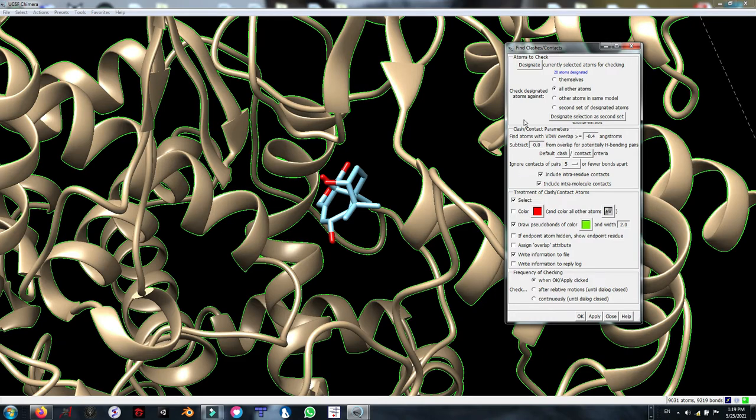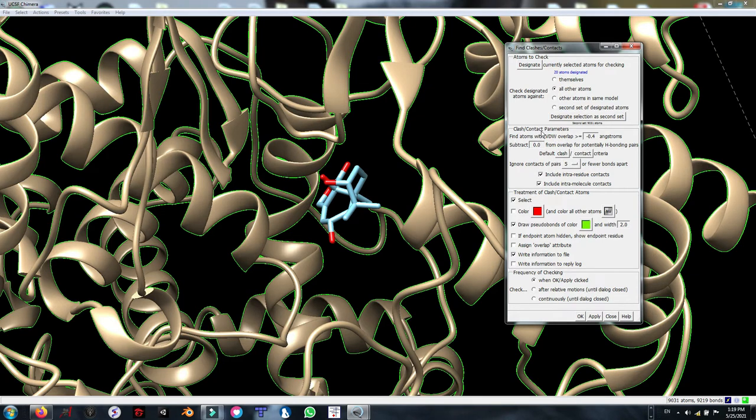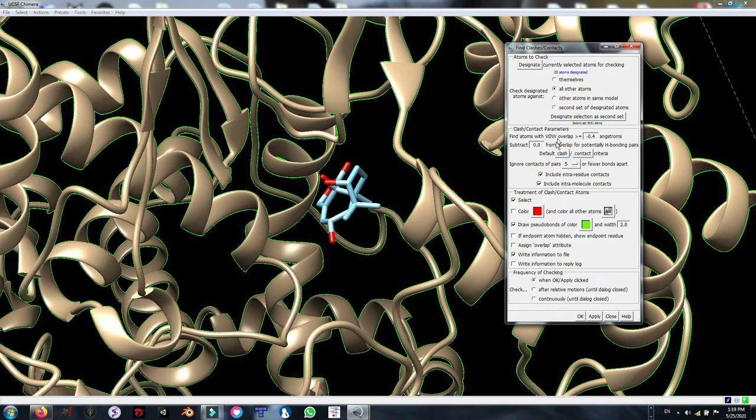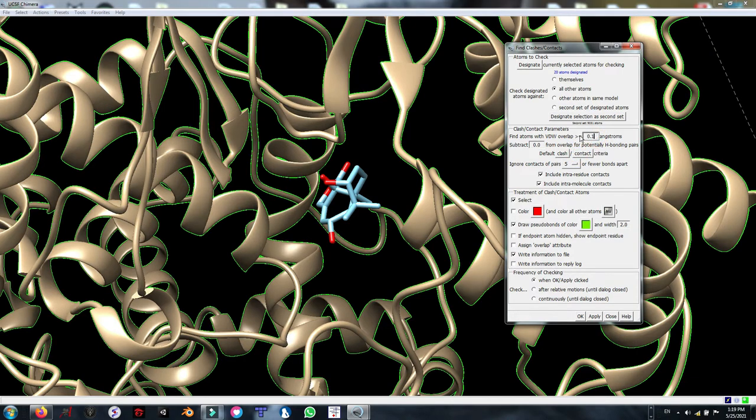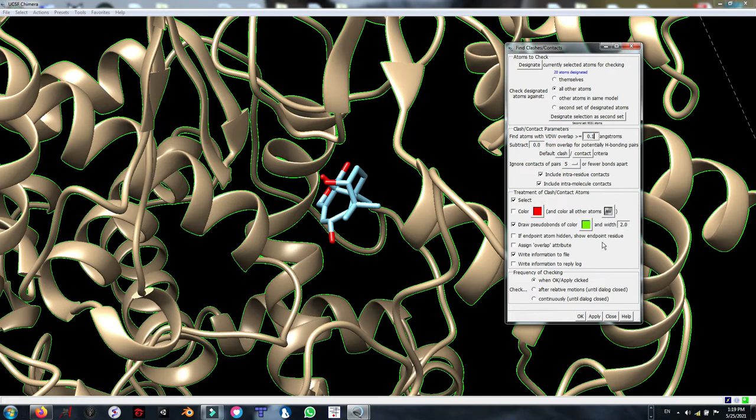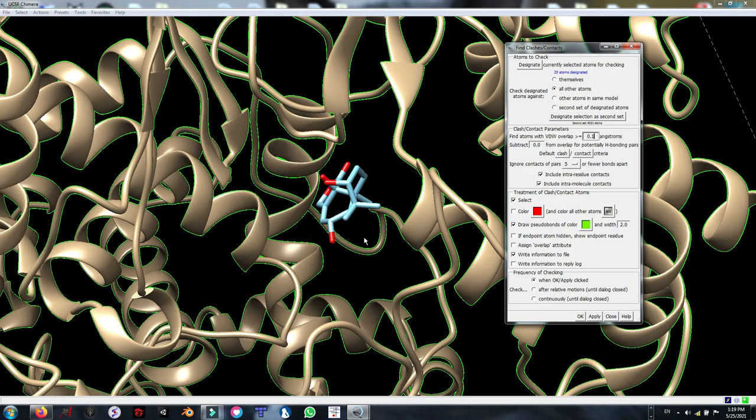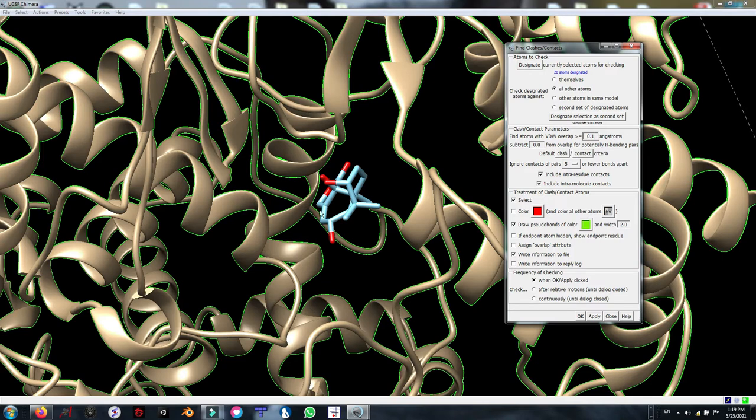In the second part of the Find Clashes and Contact tools, we are going to define the parameters for analyzing the contact. If you simply choose this option here, it has a predefined criteria. I am going to select contacts and make it as 0.1. The other options are good to be as default. Just remember to click and check this box, write information into the file. So if there are any contacts in the range of 0.1 angstrom, the software is going to save it into a file.